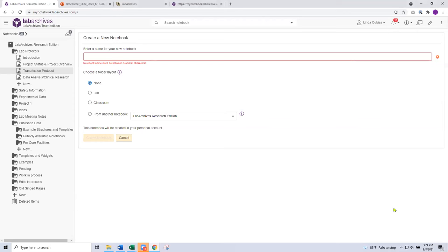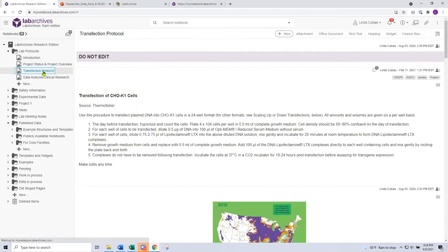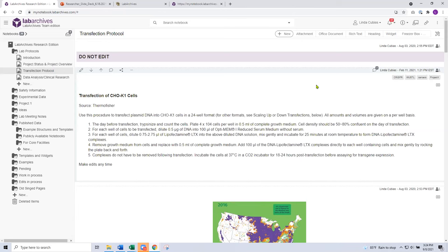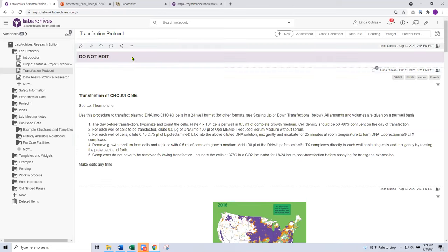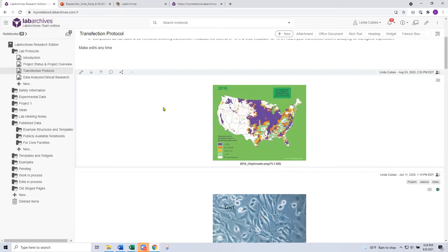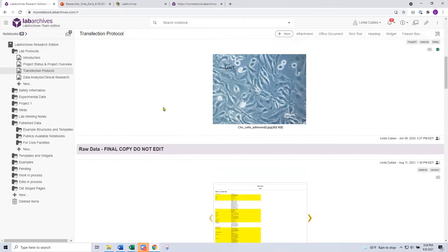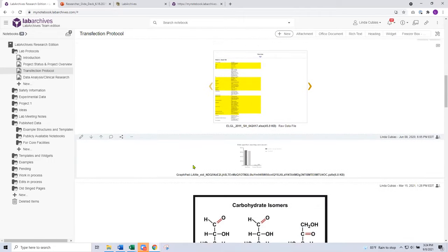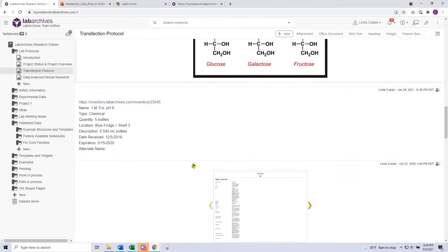That was a quick navigational tour and lay of the land inside a notebook. Next, I'm going to go back to my transfection protocol page to give you a tour of a populated page. This is just a sample page — certainly every page is going to look different based on your discipline and the type of data you work with. This page at the top includes a heading, a rich text entry which is a copy of a protocol. I've got a variety of attachments, image-based documents, an Excel document, a GraphPad Prism file, and additional documents all down this page.